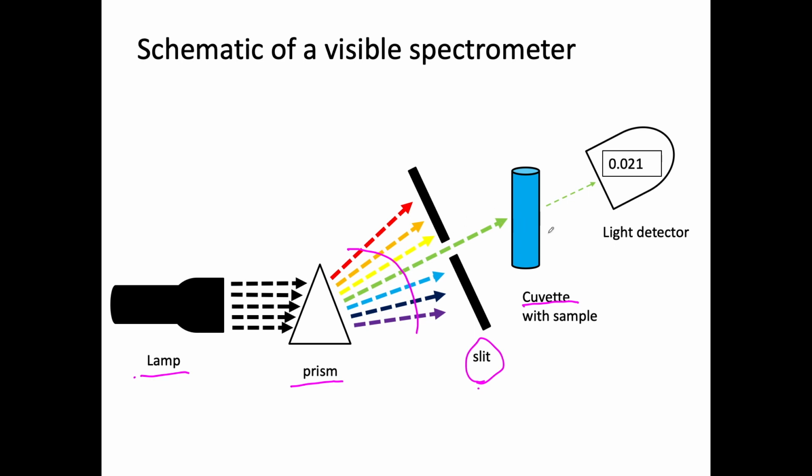The light that passes through the cuvette is then picked up by a detector which records the quantity of light. Typically, one first measures the intensity of light when the cuvette is filled with nothing but water as a reference. The cuvette is then filled with solution, and of course the detector picks up less light. The intensity of light that reaches the detector can then be used to find the concentration of solute in the cuvette.